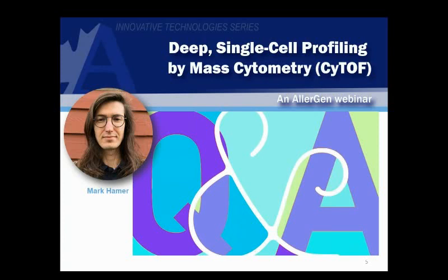Another one that I always ran into trouble with is intracellular staining. It used to be my nightmare for flow because you get so much background fluorescence from actin cytoskeleton and other intracellular proteins. I always likened it to thinking about the number of proteins on the surface of a sphere versus the number of proteins inside a sphere. You really go up exponentially, which gives you a lot of background. So how is CyTOF able to deal with that kind of problem?